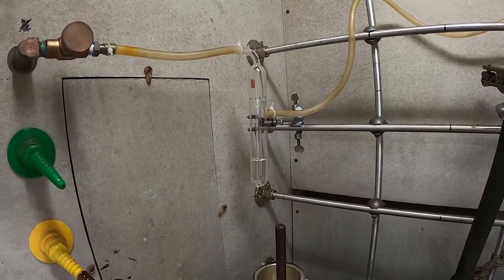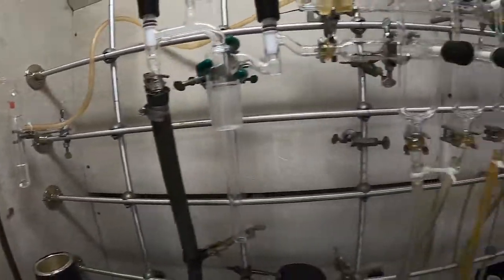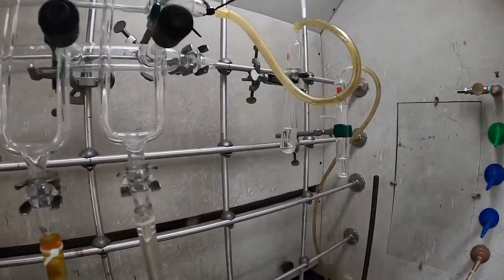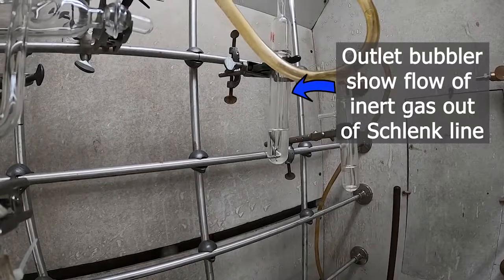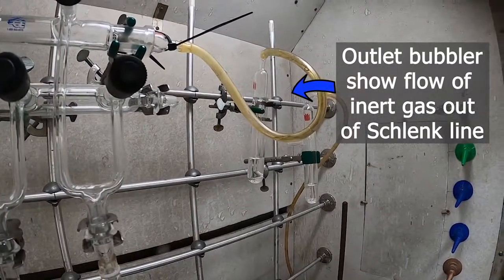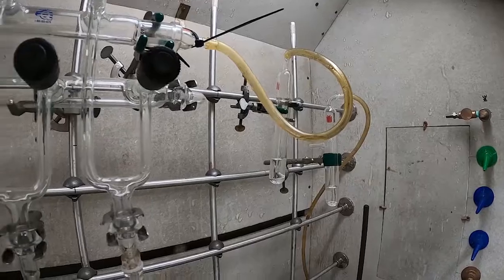So here we can see the inlet bubbler for this system, letting nitrogen in. And the outlet bubbler is over here. You can see gas is coming out through the outlet bubbler there at about the same rate.